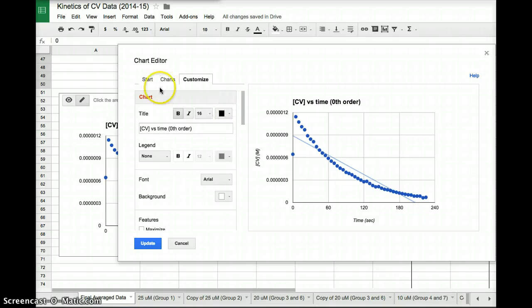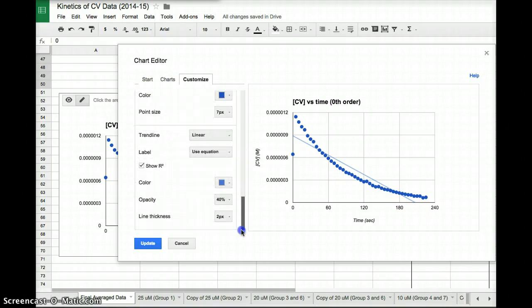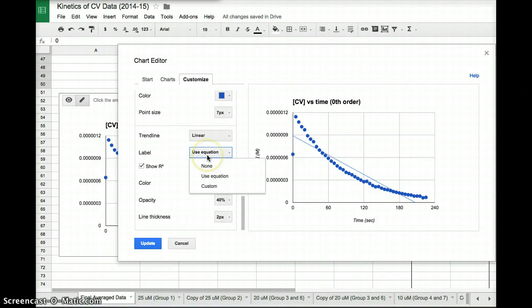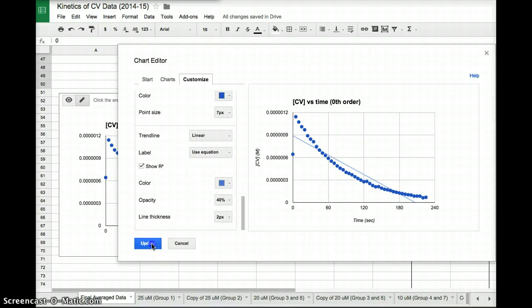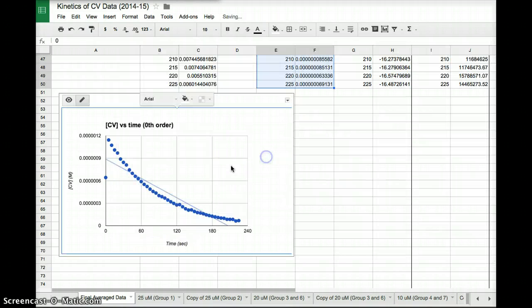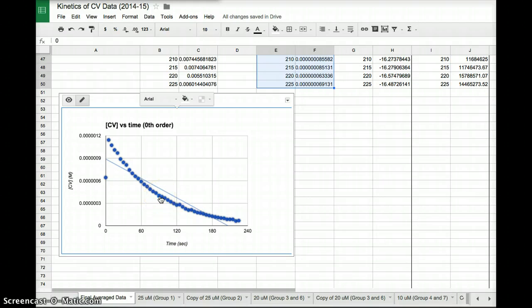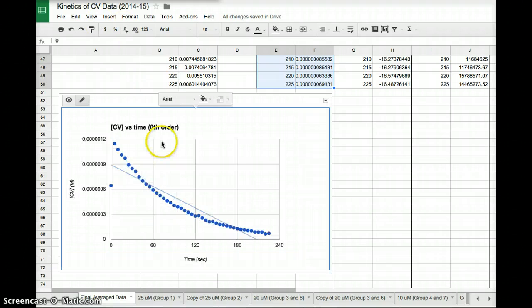So that's how we would edit our chart. That's how we would have all the great function stuff that we want. Okay? If we hit update, we can see there is our chart. Here is our plot. Here is our best fit.